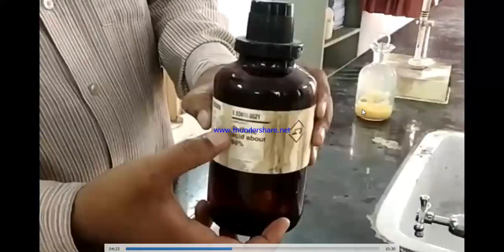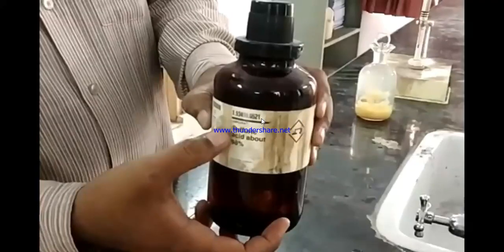The 30 minutes period is over. You see students, a precipitate is formed at the bottom. It's not exactly brownish but yellowish brown type. Now we will add 1 milliliter of this concentrated H2SO4.